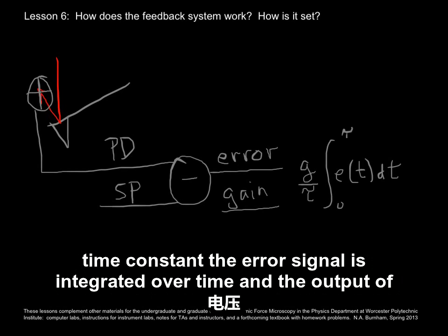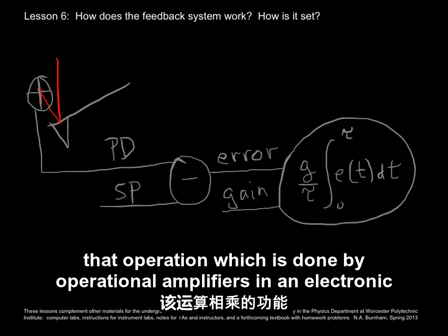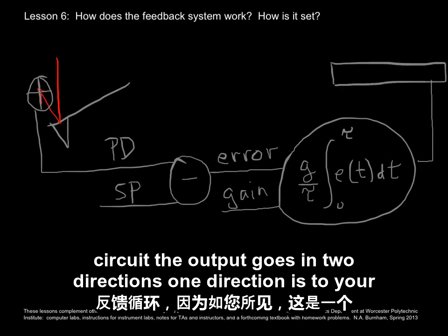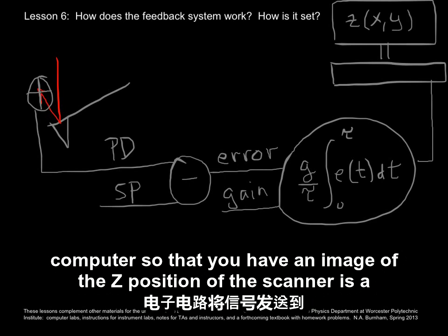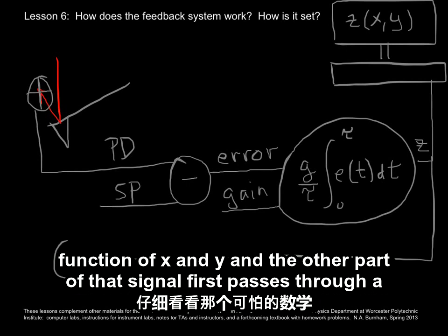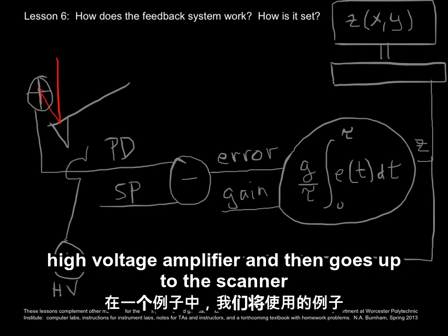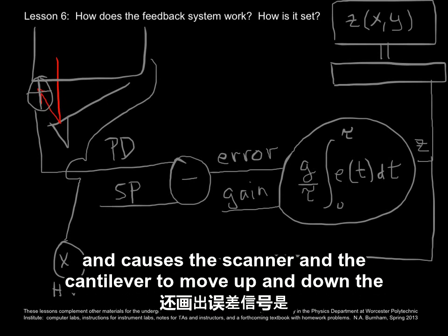and the output of that operation, which is done by operational amplifiers in an electronic circuit, goes in two directions. One direction is to your computer so that you have an image of the Z position of the scanner as a function of X and Y. And the other part of that signal first passes through a high voltage amplifier and then goes up to the scanner and causes the scanner and the cantilever to move up and down.